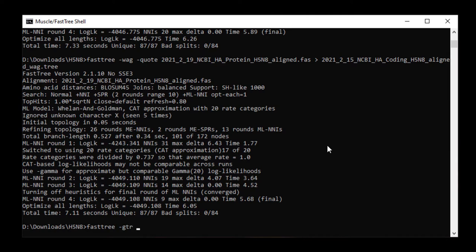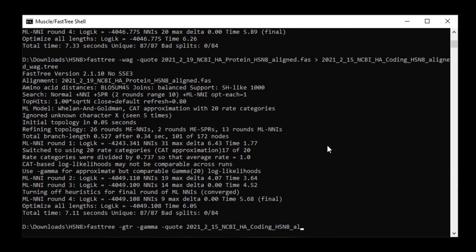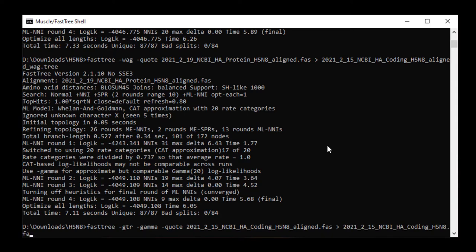I then ran FastTree on the coding sequence. I used the -GTR and -gamma options for this nucleotide tree however when I started running it I realized that I'd done something wrong and I typed control C to stop the calculation.